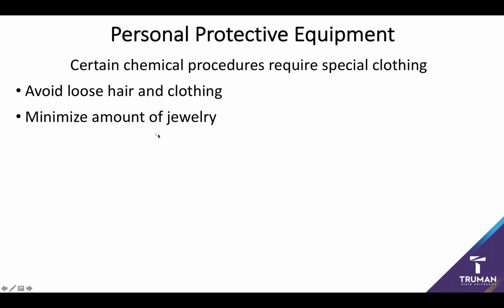And many other incidents have occurred with, say, even metal jewelry doing something very similar. So again, make sure that you're very aware of any jewelry, and try and keep it as close to your person or under your clothes when possible. Similarly, also try and maximize skin coverage, as this prevents the amount of skin that's open to, say, exposure from acid, and because I'd prefer all of you to not get acid burns.